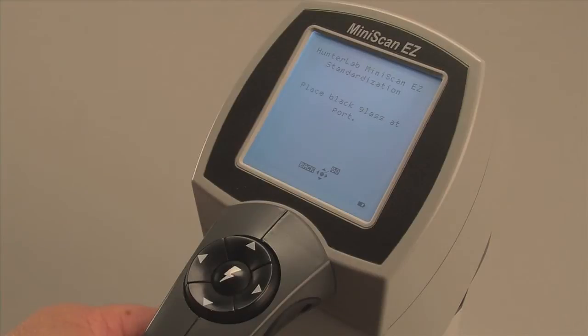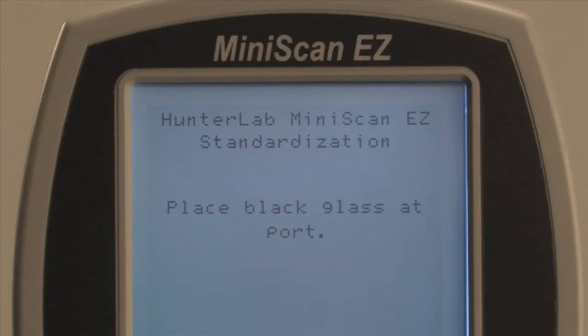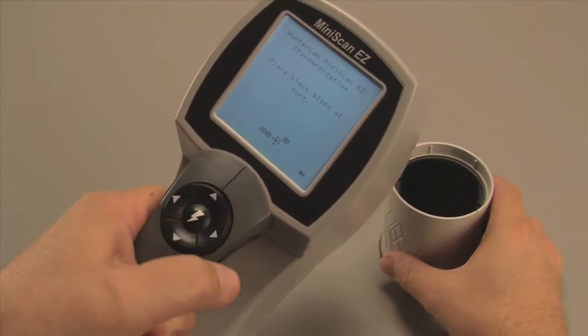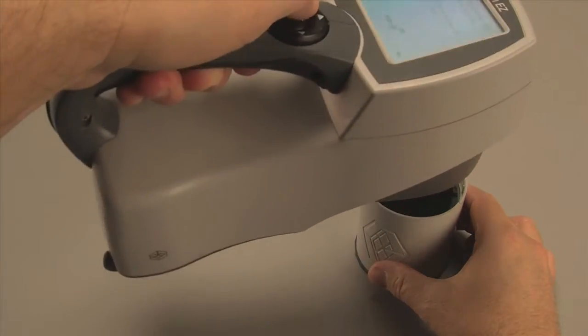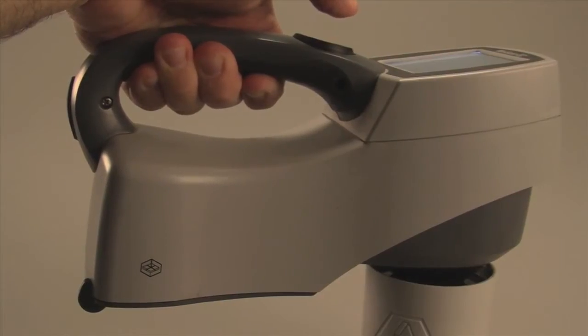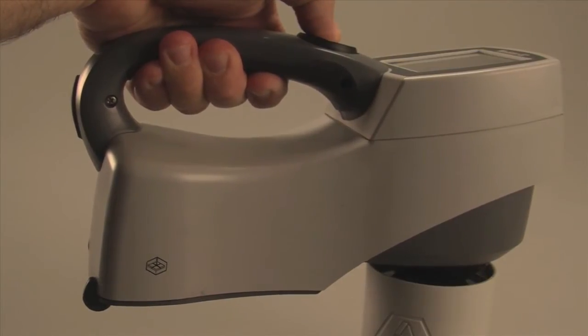The menu will prompt you to place the black glass tile to the instrument port. Remove the end cap of the standards cylinder that covers the black tile. Press the nose cone to the tile, ensuring that it is flat to the glass. Press the center Go button.